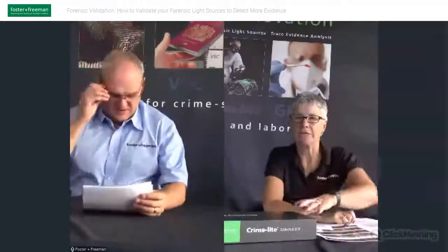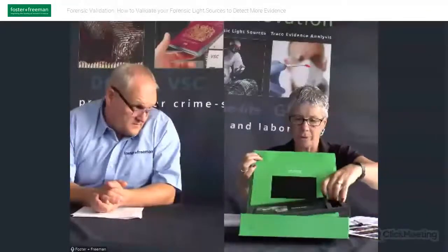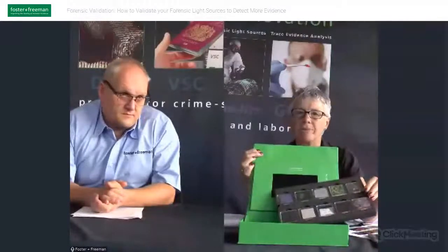I did want to talk a little bit about the sample kit. So we have the sample kit here. Now, about half of these samples are simulated, and I wanted to make it clear as to why these are simulated. The kit contains a booklet we've already described within the webinar, but these are our 20 samples.